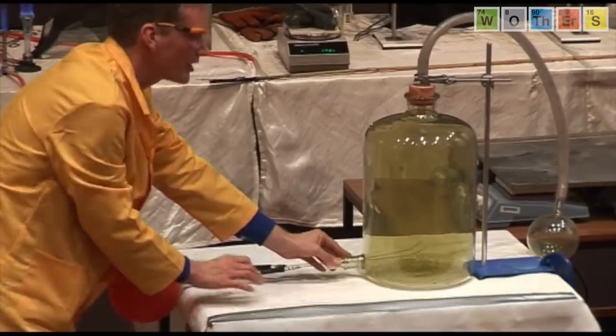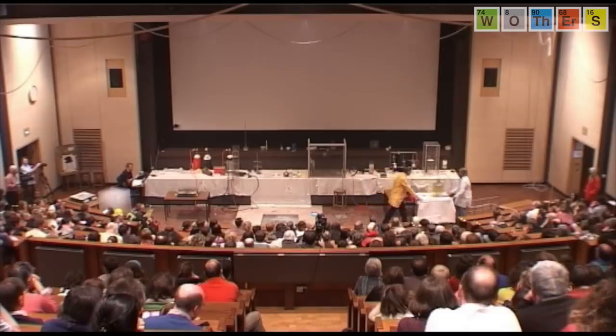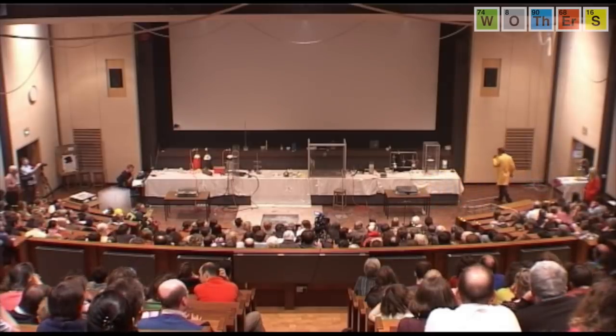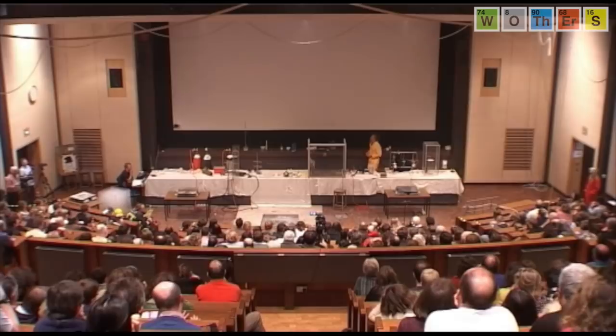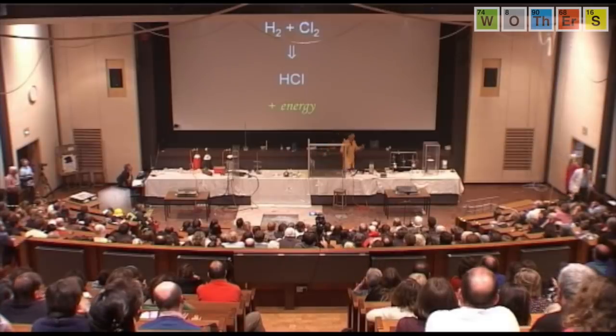But there is no carbon being formed. It's only from the acetylene there. The hydrogen is burning by itself. We can have that one out, thank you. Okay, good. So the hydrogen burnt in the chlorine, so no oxygen there at all. And the reaction that we saw is hydrogen combining with chlorine. No bang, it was just burning very nicely.